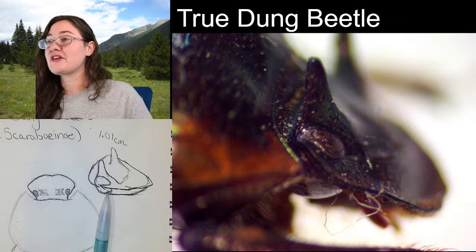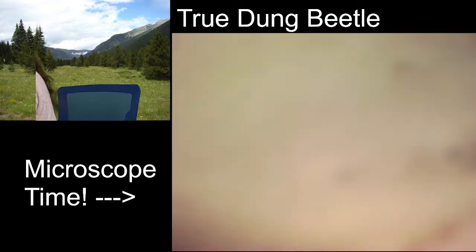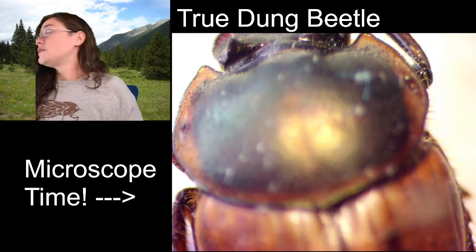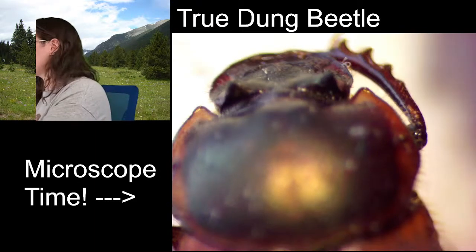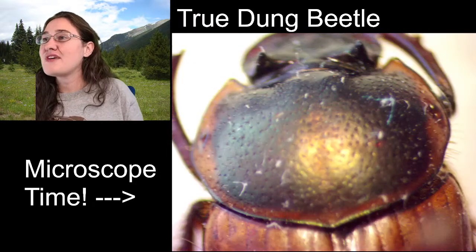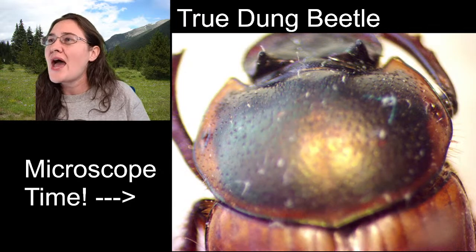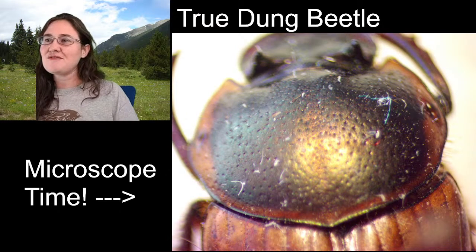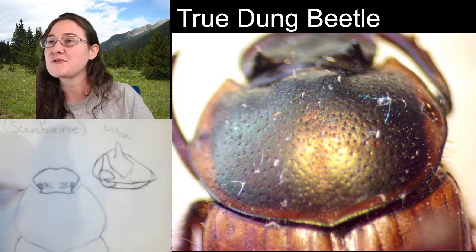All right, let's look at the pronotum. The top and central areas of the pronotum are this metallic green color, and the edges of the pronotum are lined in orange. And if you see all of those little punctations, those little dots in the pronotum, I do believe that there are hairs coming out of all of those little dots. So, cool little factoids as we're sketching.